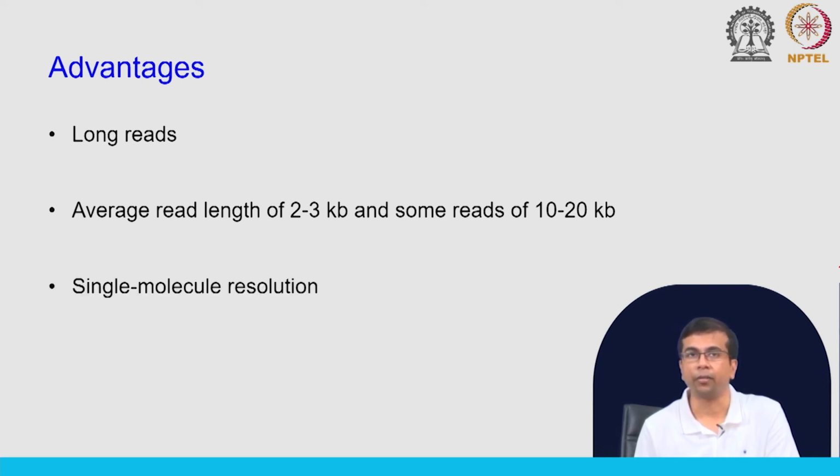We have single molecule resolution. So, we have seen we are getting this data from a single DNA molecule. We are synthesizing the complementary strand of a single DNA molecule and this process is happening across multiple wells, multiple ZMWs, we have discussed that, and millions of these ZMWs, we are getting parallel signal which will give us sequence for millions of molecules, but at single molecule resolution. So, it is incredibly powerful.